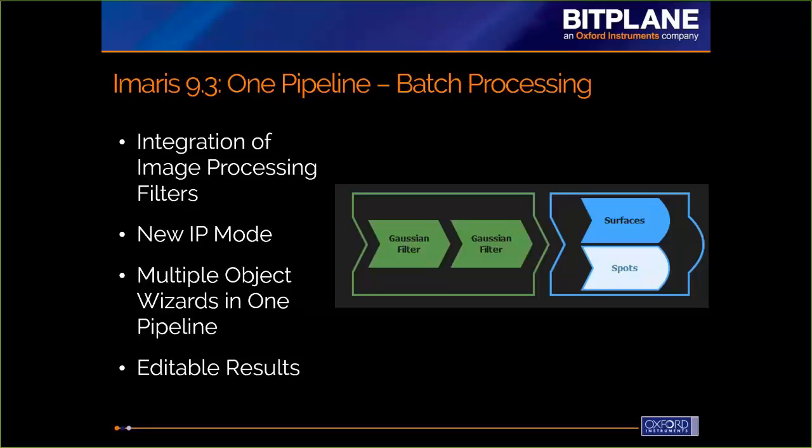With this change of implementing the ability to use our image processing filters, we've also added a new mode. It's our image processing mode, and you'll see that within the Surpass view, or the main 3D visualization and analysis view of Imaris, there's a big button at the top for this image processing mode, and I'll take you through that when I get into Imaris in just a minute.